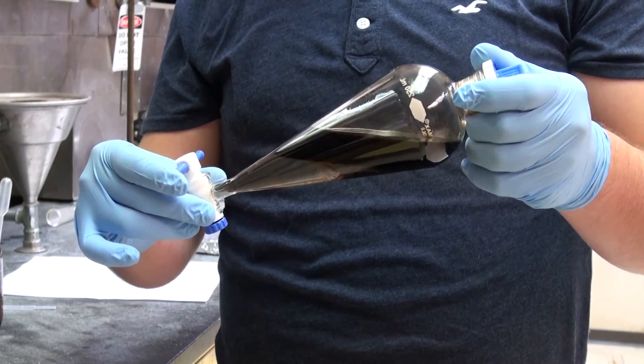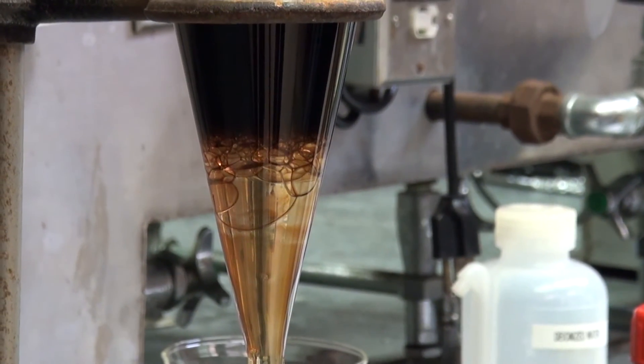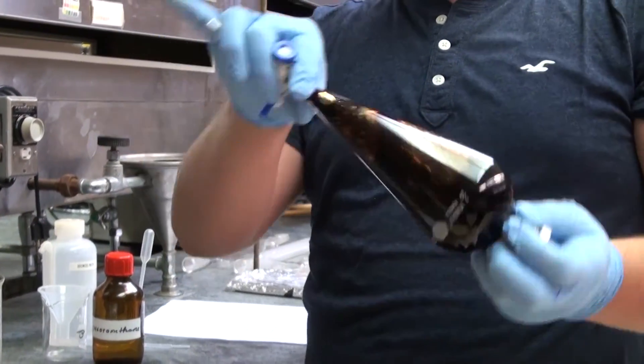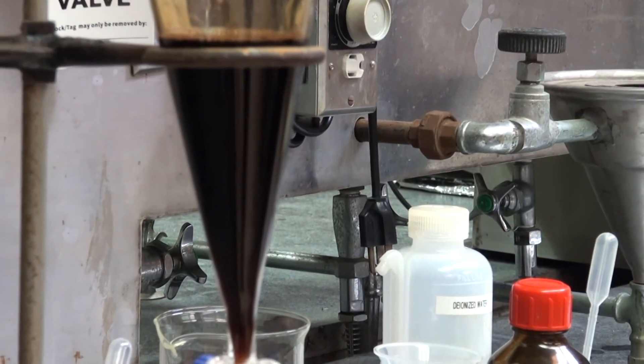If you shake the separatory funnel too much, you will see an emulsion layer in between the organic and the aqueous layer. If you shake it even more vigorously, you will have an emulsion layer with probably no chance of separation.